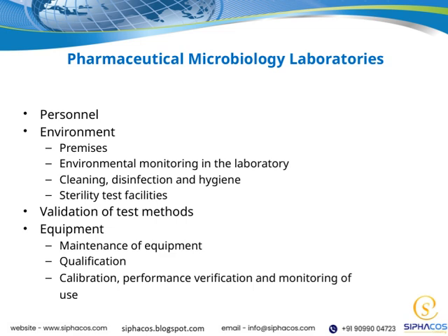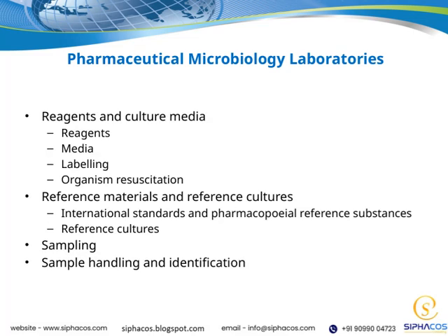Finally, I want to highlight that all of these elements come together within pharmaceutical microbiology laboratories. They work in harmony to support quality control, ensuring that our pharmaceutical products meet the highest standards for safety and efficacy. Let's take a closer look at the core components of pharmaceutical microbiology laboratories.